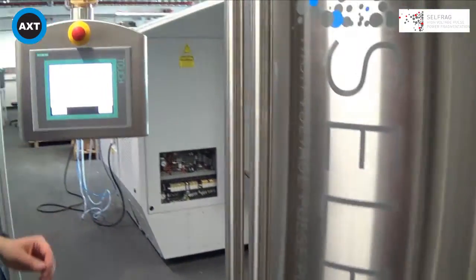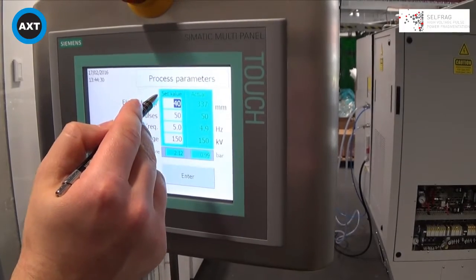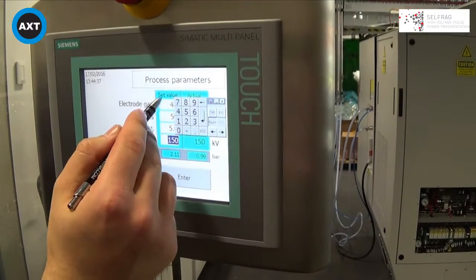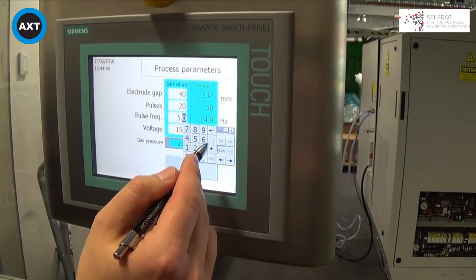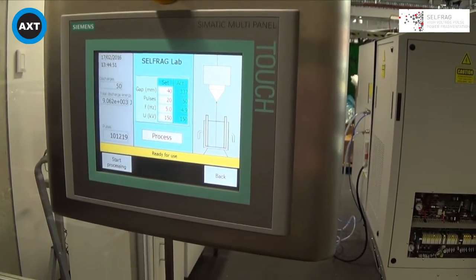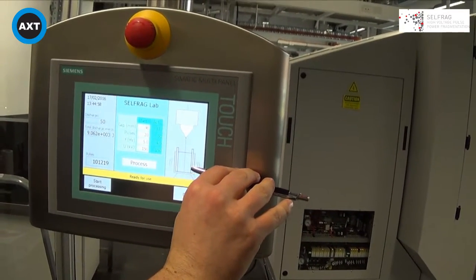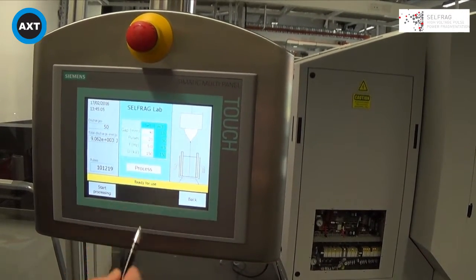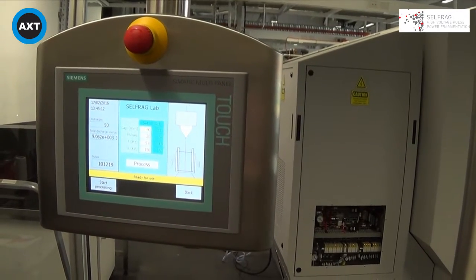The machine itself is extremely simple to operate — designed for everyone from undergraduates to professor level. A simple touch screen allows you to control the electrode gap, which we can change very easily, the number of pulses, the frequency of these pulses, and the voltage that we work with. All we have to do then is press start processing. When we press go, a pictogram shows the process vessel lifting up, bringing the electrode towards the counter-electrode to the gap you have set. The doors will lock, keeping everything very safe — the doors cannot be opened — and then whatever you place inside will be broken.